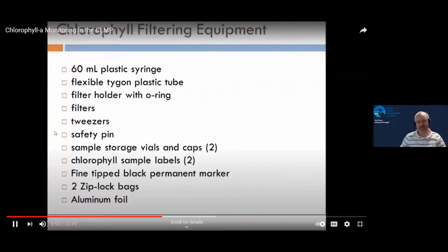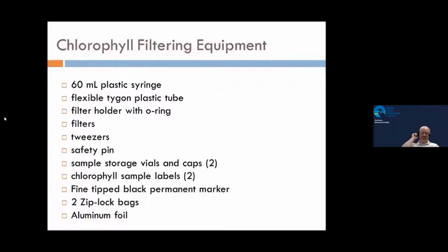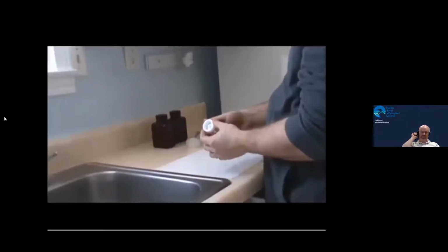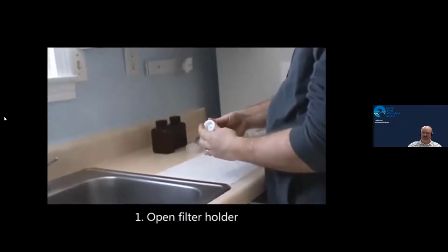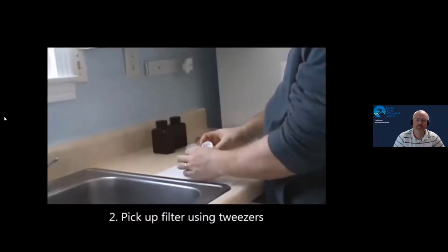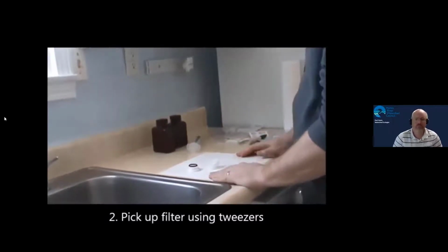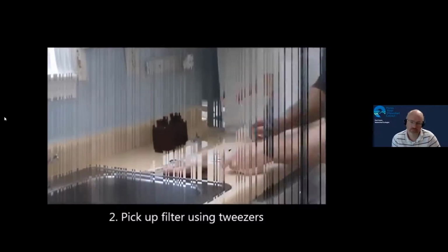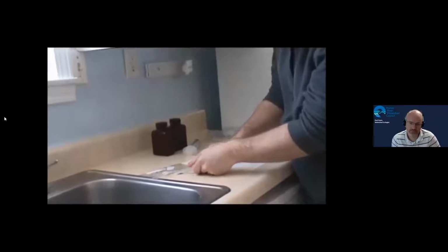The best place to filter a chlorophyll sample is indoors, by a sink, and out of direct sunlight. Make sure you have all of the equipment listed. Ready to go? First, unscrew and open the filter holder. Use tweezers to pick up and move the filter. Never use your fingers. The filter is a glossy and opaque white circle. Be sure not to use the filter separators, which are translucent and look more like tissue paper.